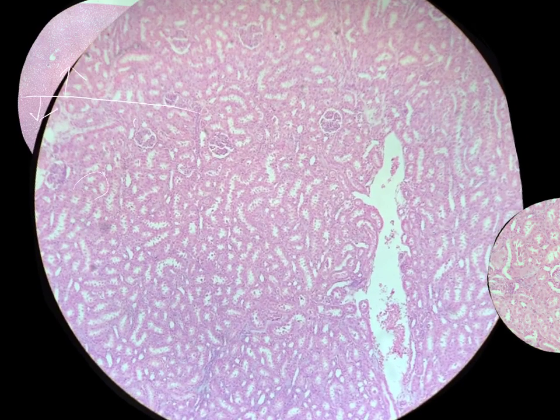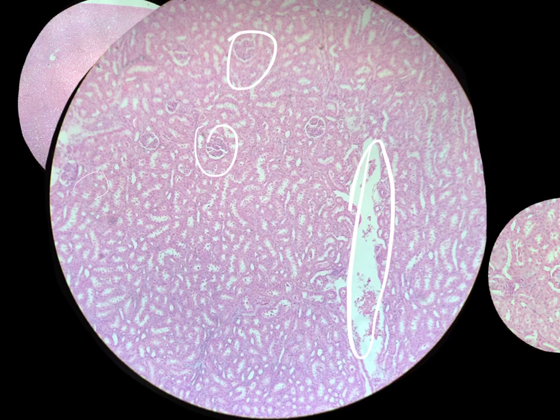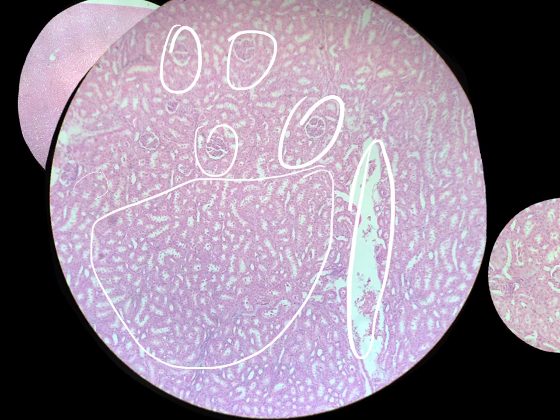As we get a little bit closer, we get a better perspective of the actual glomeruli here. You can see a large blood vessel, probably a segmental artery here. And what you can see is the majority, we're in the cortex, we know that because the glomeruli are all over the place. But all of this whole bunch of tubules here, really the cortex is made up of either proximal or distal convoluted tubules.